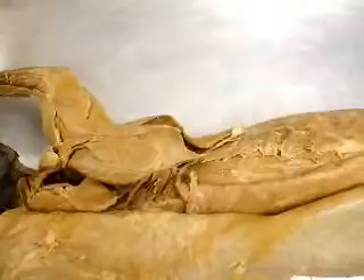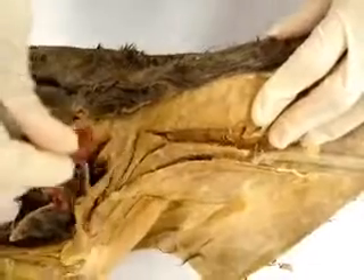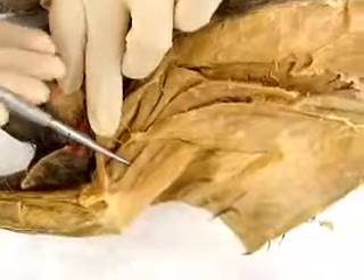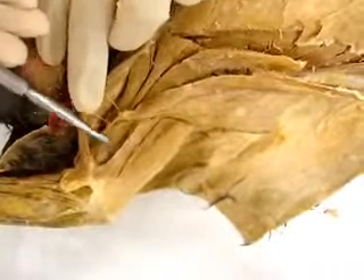For the biceps brachii, go underneath the pectorantibrachialis — there's the biceps brachii right here. And right below that right here, this is the epitrochlearis.